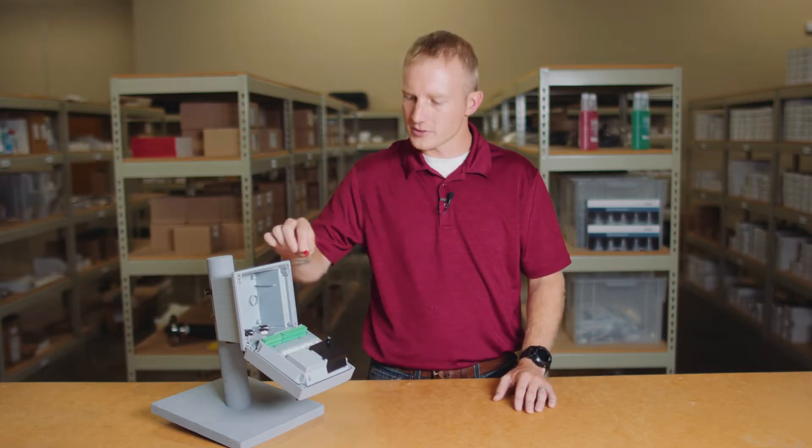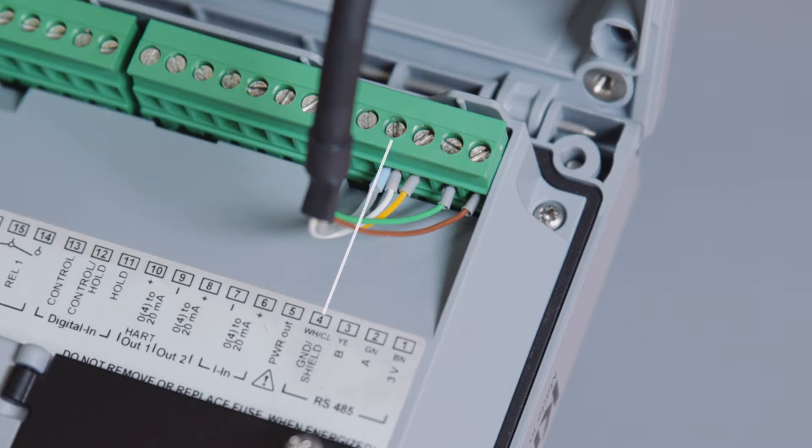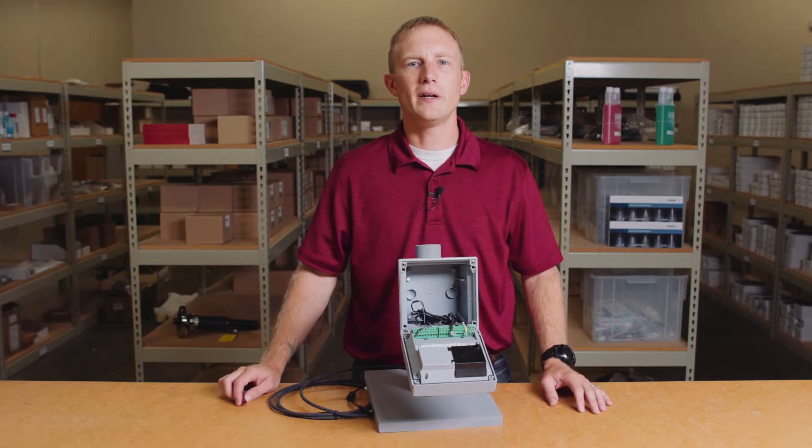The last terminals are for the MemoSense RS485 sensor connection. Terminal 4 is for the ground and shield, or white and clear wire. Terminal 3 is for the yellow wire. Terminal 2 is green, and Terminal 1 is the brown wire. Once we've completed our wiring, let's close up the transmitter and apply power.